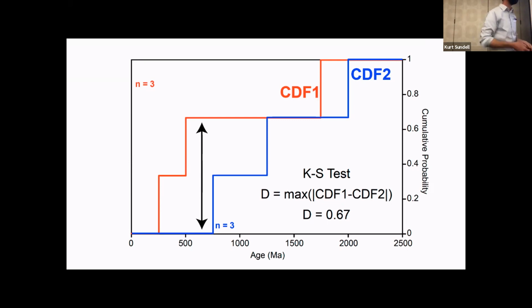What we find, and we can demonstrate this using some of this new software, is p-values are not well suited for detrital geochronology. You'll see p-value tables sometimes. I would treat them with extreme caution. Most people agree that you shouldn't be using these in detrital geochronology. They're not well suited for a bunch of reasons that Ramesh's 2013 paper goes over.